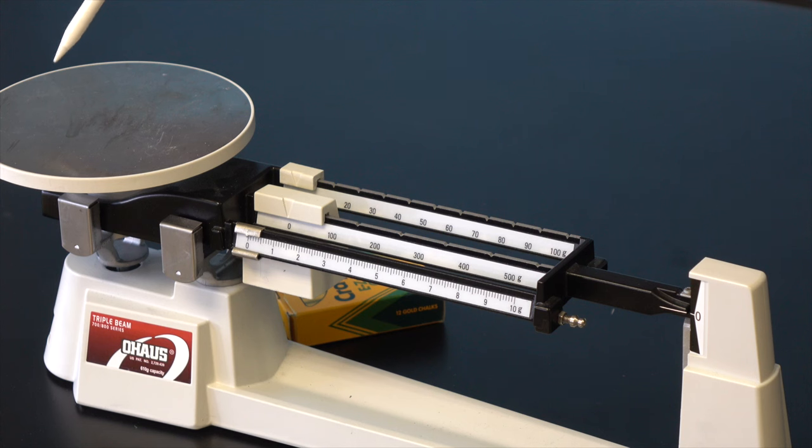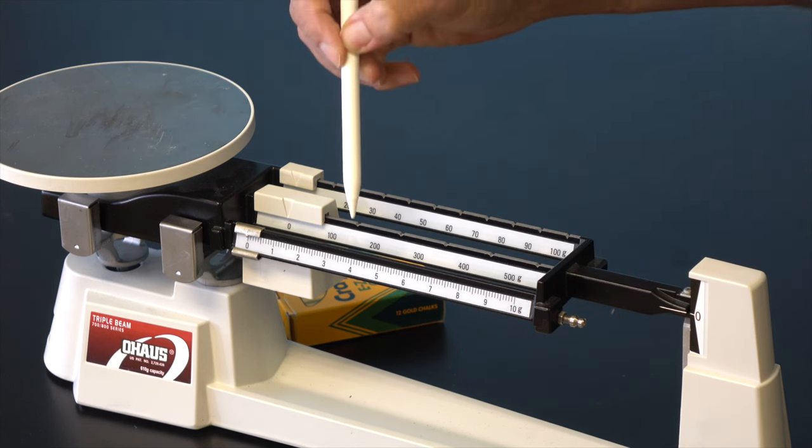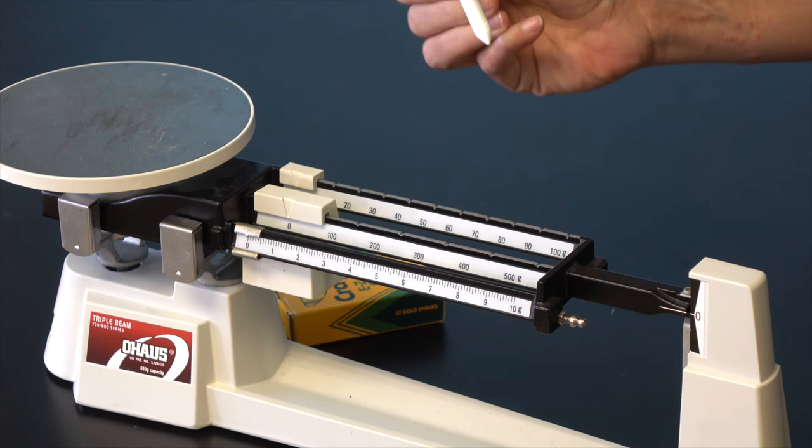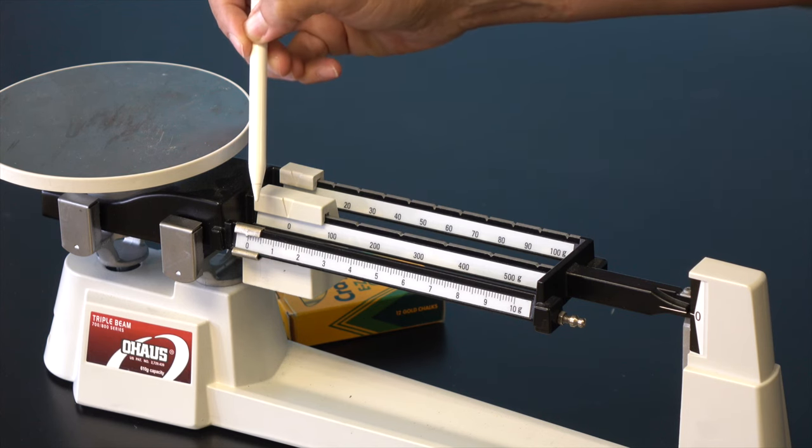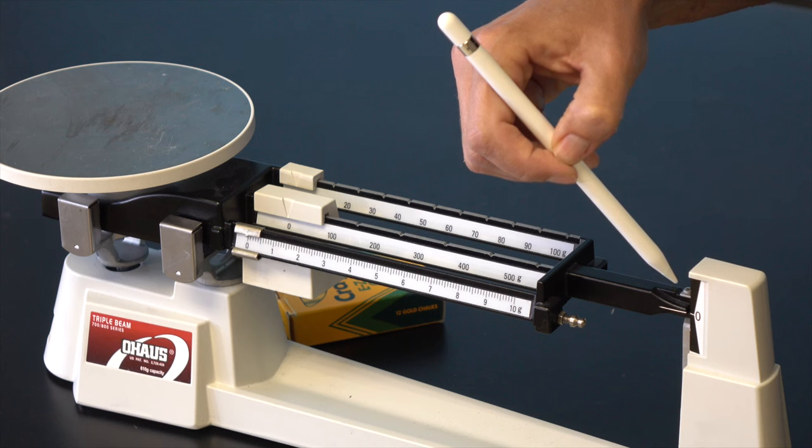This is the pan under which the object is placed. These are the beams. This is a triple beam balance because there are three of these beams. These are the riders. And this is the pointer.